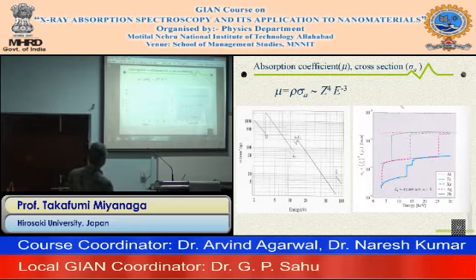After these normalizations, we see no dependence on energy, so it shows the energy dependence is the third power, a straight line. Another point is the coincidence of several atoms, here and here. This means the cross-section has a Z to the fourth dependence.